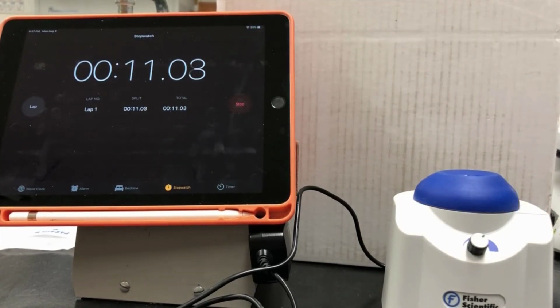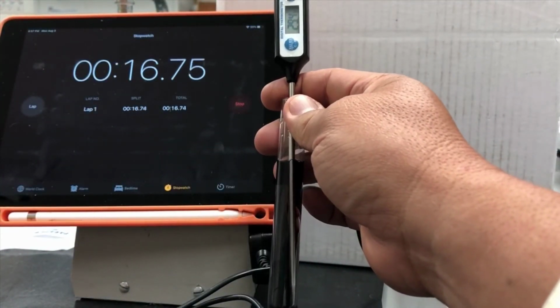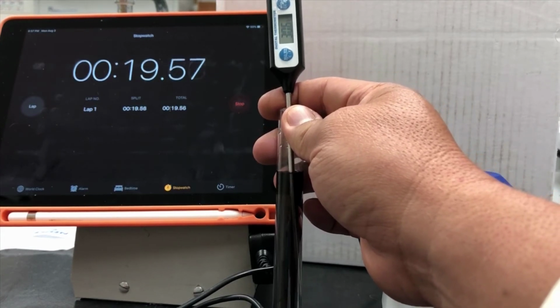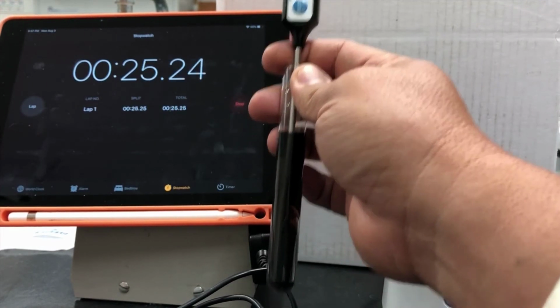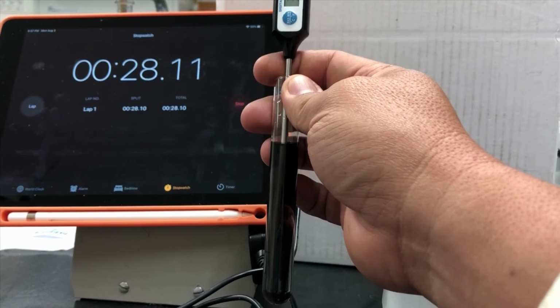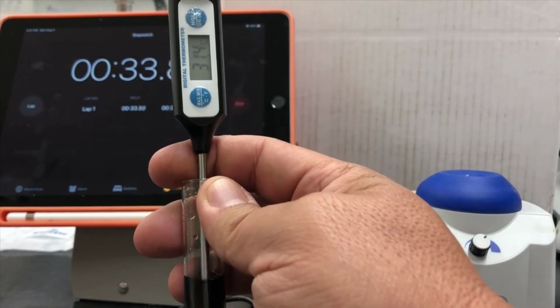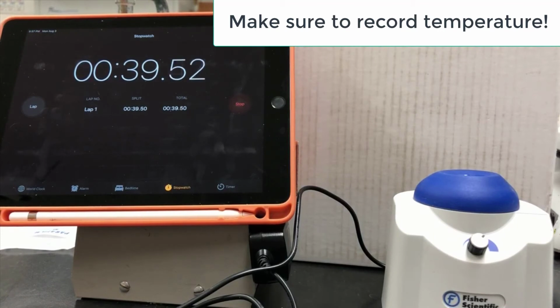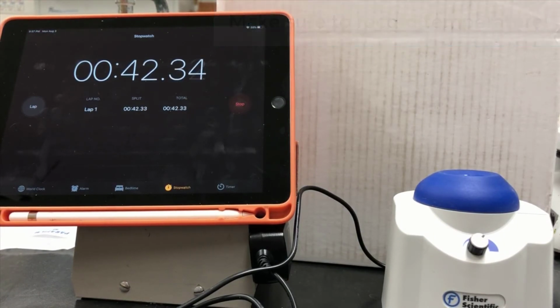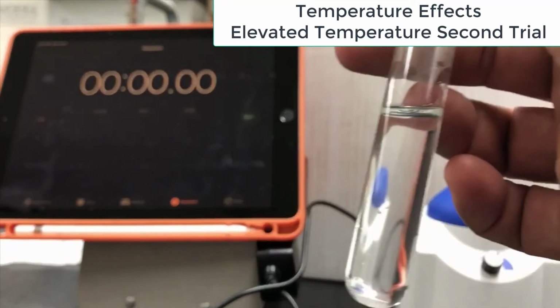So we'll go ahead and stop this one. I'll record the temperature so you can see about what it was. And perhaps this is going to be accurate, but it was supposed to be, yeah, right around 30 degrees. This one's going to be at, looks like around 31 point, see if you can bring that a little closer, 31.4 degrees Celsius. So we'll redo that, and hopefully we'll get similar results, but we didn't start the time quick enough. Okay, so we're going to try a second trial of this elevated temperature.